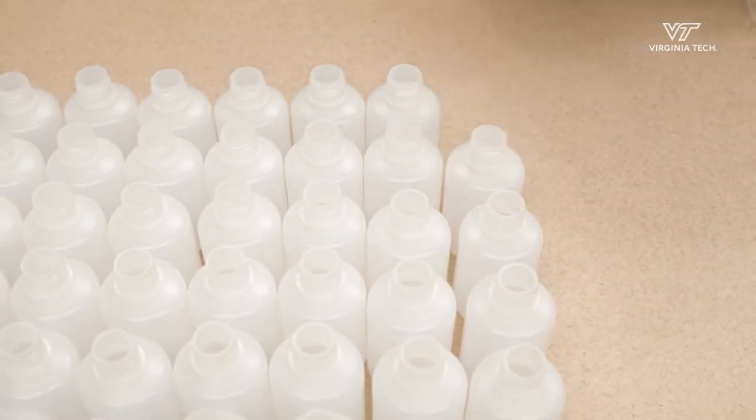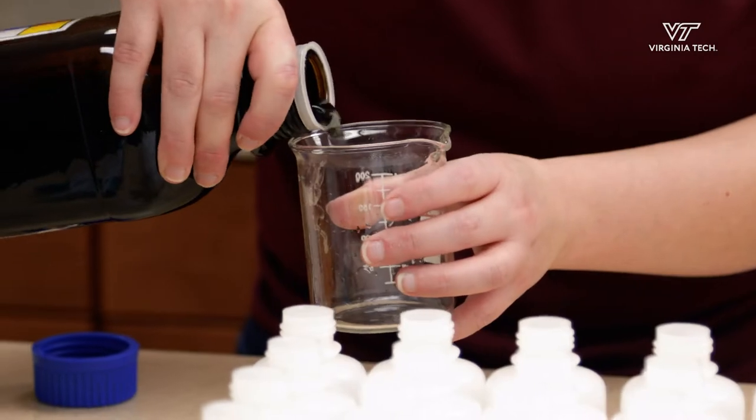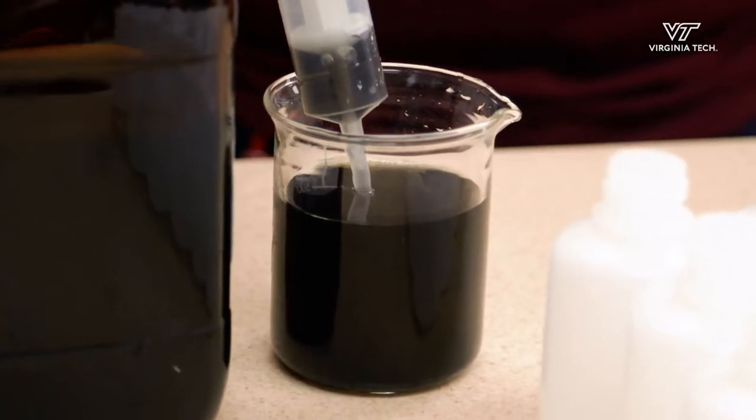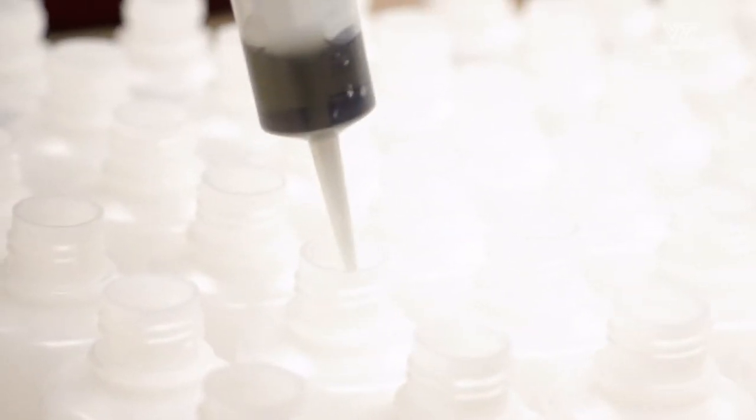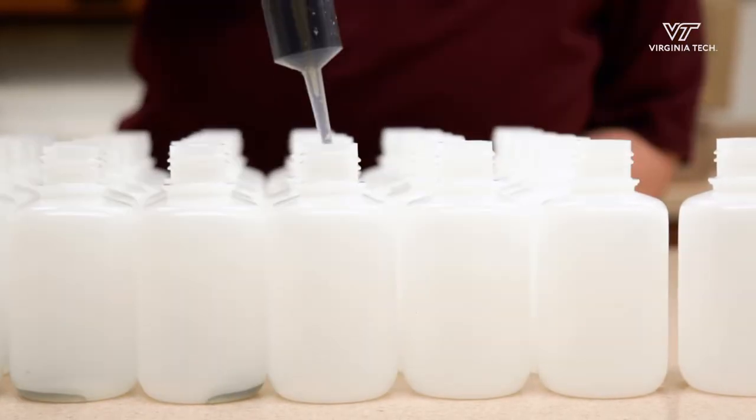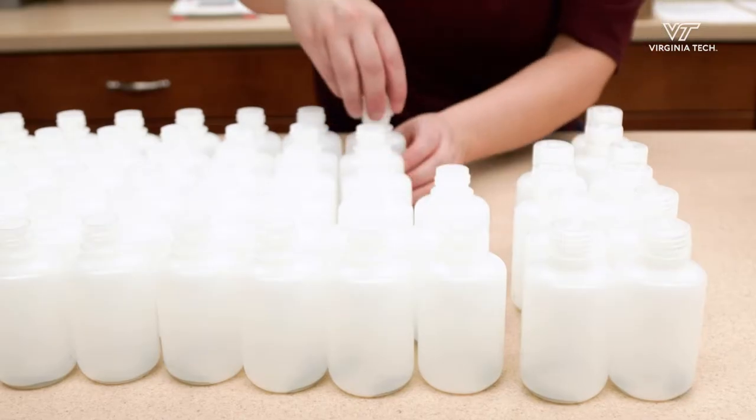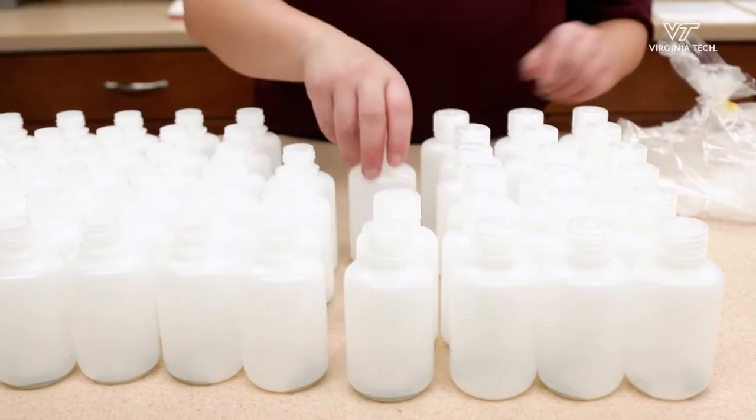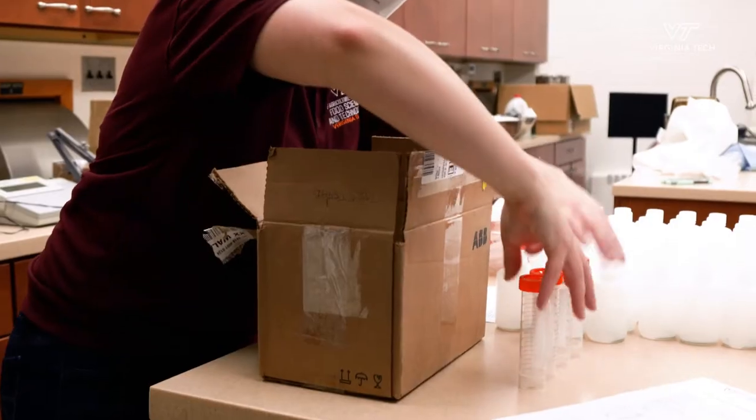Today I'm preparing juice harvest kits to send out to winemakers. These are bottles that contain a preservative. Winemakers will fill the bottles with their grape juice that they've just harvested, send that back to us for analysis so they'll know the chemical and nitrogen content before fermentation.